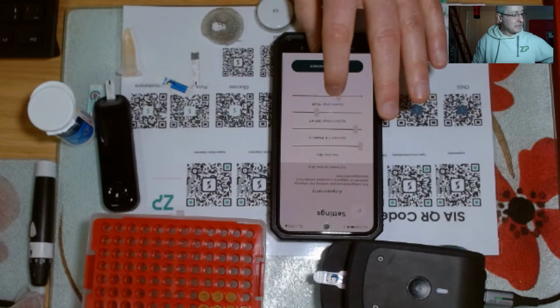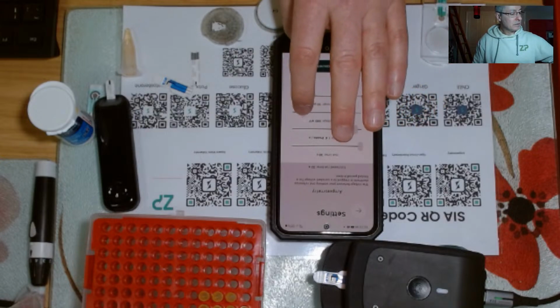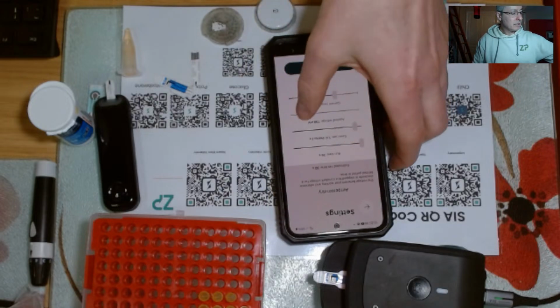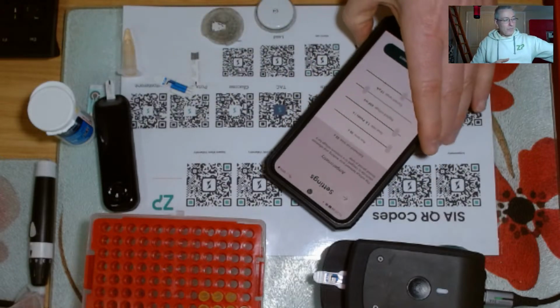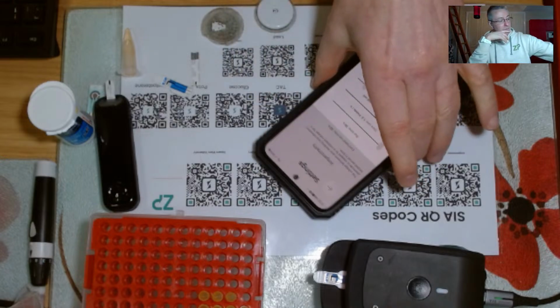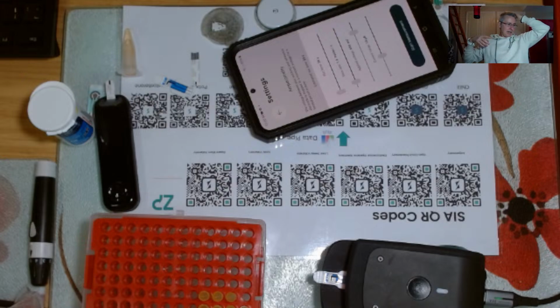and then they need to be setting the applied potential to about 650 millivolts, as opposed to, I can see what they're doing. They're using this. It's not their fault. I can see they're using the QR code that the machine has. Just getting this to 650. They're using the QR code here, which is for glucose, when in fact I would want them to maybe use the amperometry mode here. So it's probably slightly our fault.